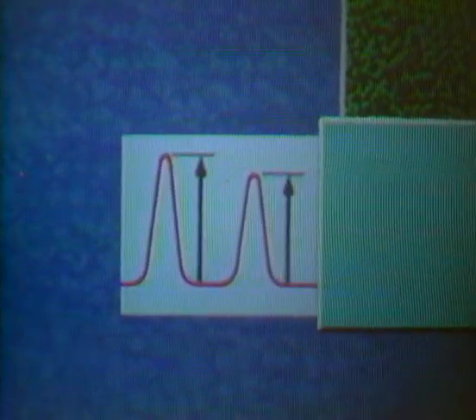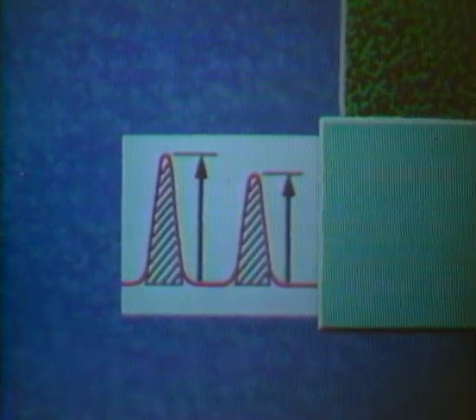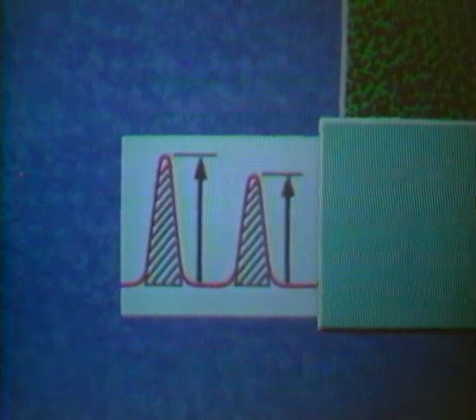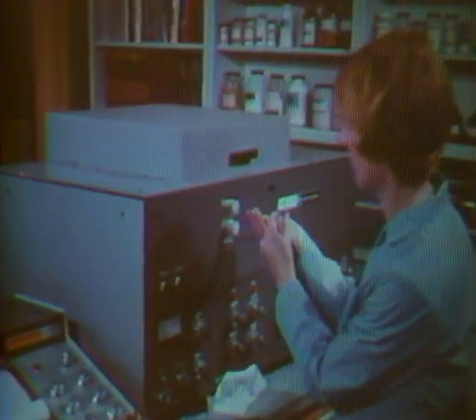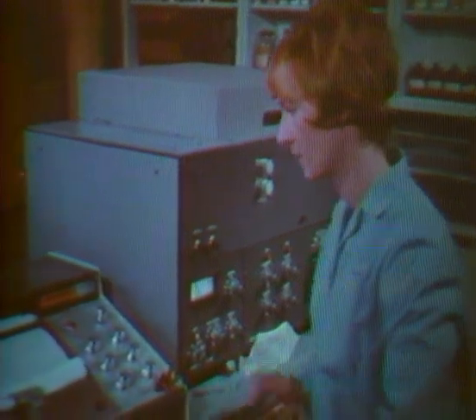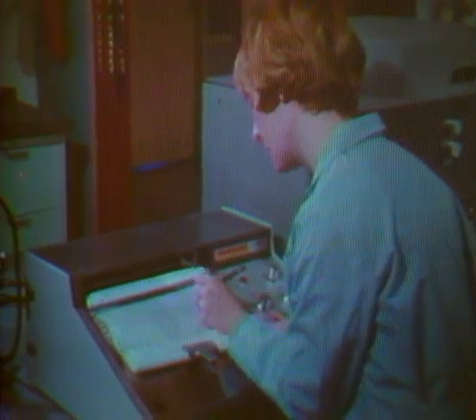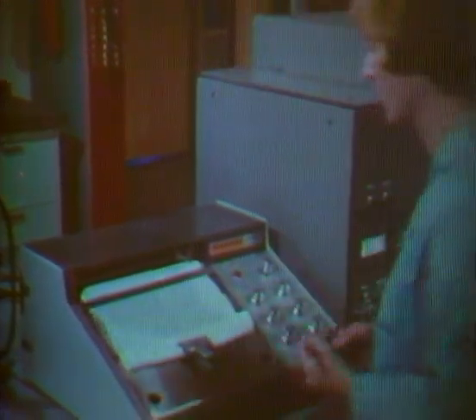Based on the height or areas of the individual peaks after proper calibration, the amount of the sample components can also be established. Depending on the choice of the moving and the stationary phases and the form of the system, many chromatographic methods exist. Among these, gas chromatography provides the best possibility among all analytical techniques for the separation and analysis of complex volatile mixtures. It is rapid, but is restricted to substances that show some volatility up to 300 degrees centigrade.